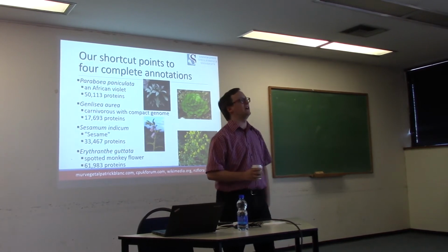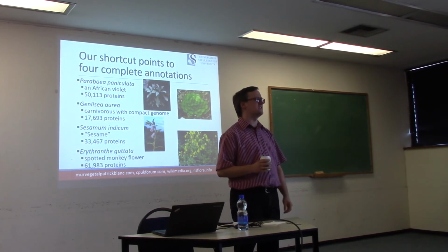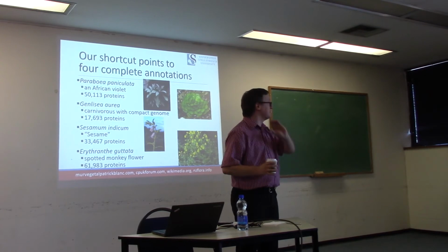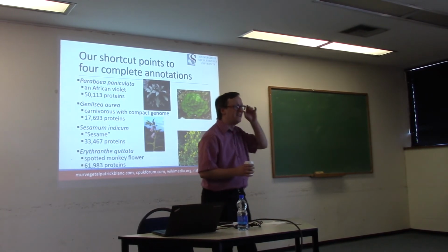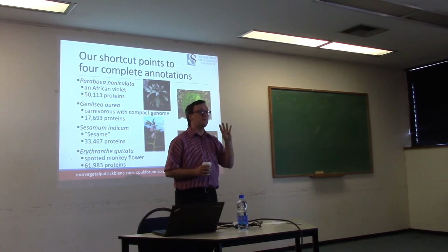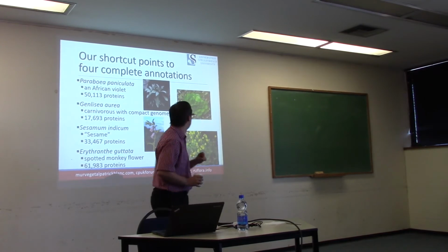So you might think, well, gosh, if you're dealing with a plant, you're going to have something with decent annotation. Maybe you should just throw some Arabidopsis at it, right? It turns out Arabidopsis is pretty far off. It's pretty far away. But we do have 4 completely sequenced species that are pretty close by that we were able to find through the RefSeq resource at NCBI.